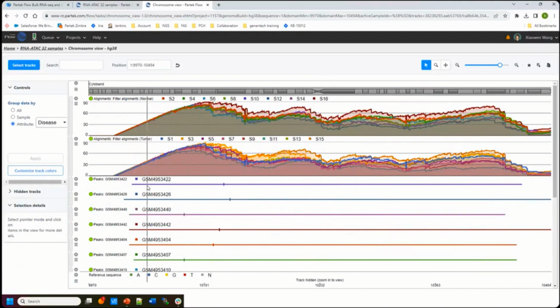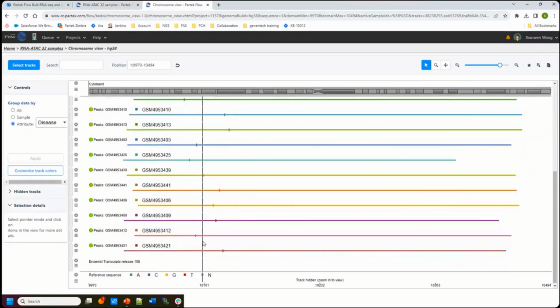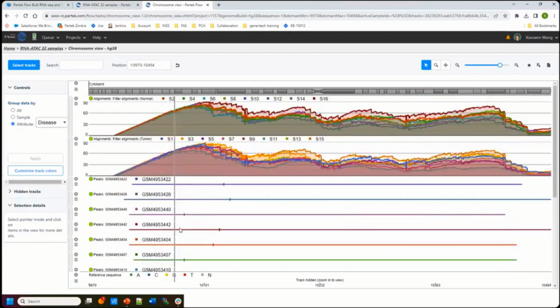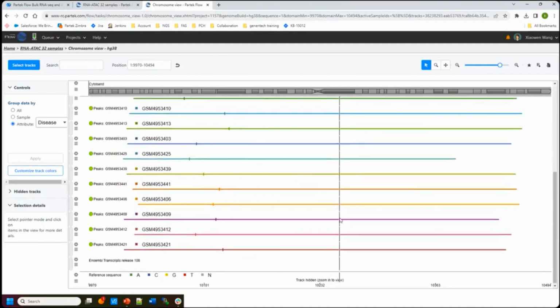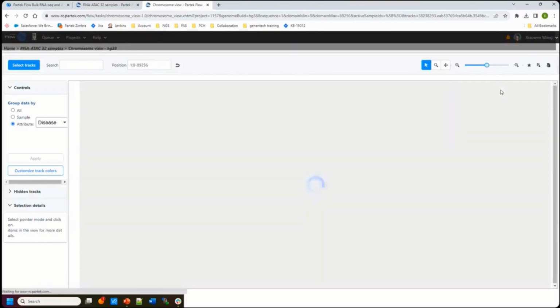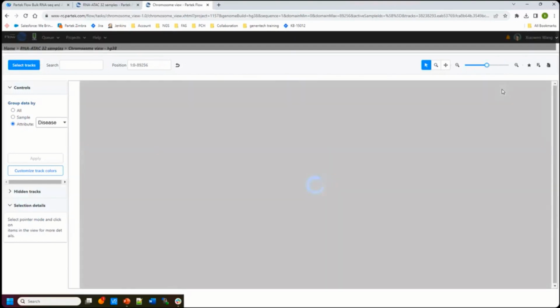And the bottom is, for each sample, the region we detected. It seems like in this region, every sample is enriched. Also, when you look at this, you can zoom out a little bit, because looking at the neighboring region is very important too.